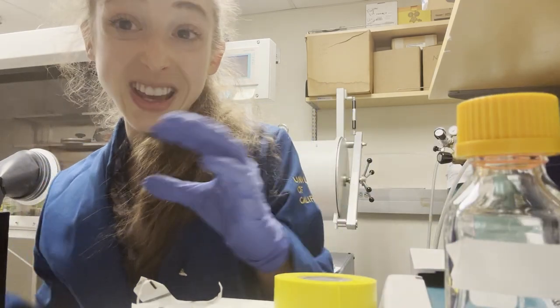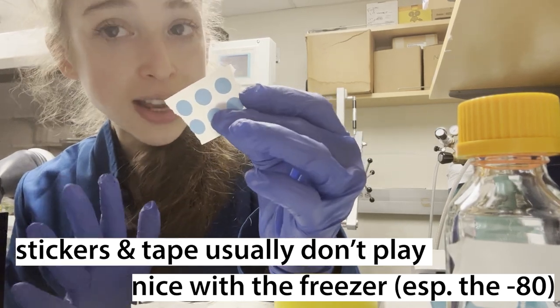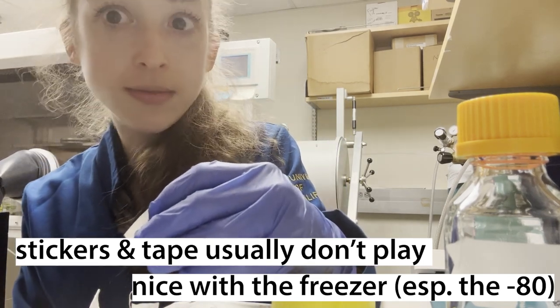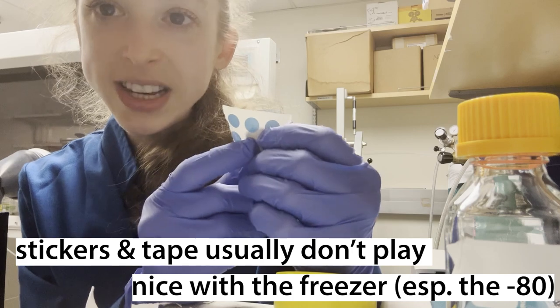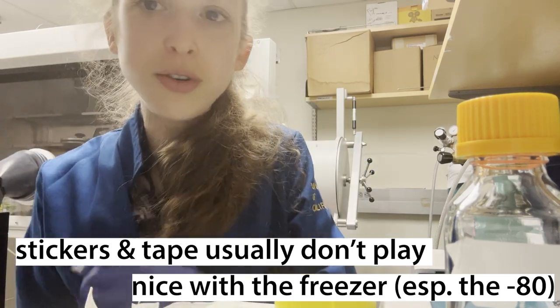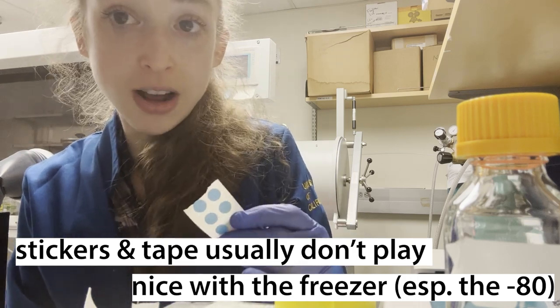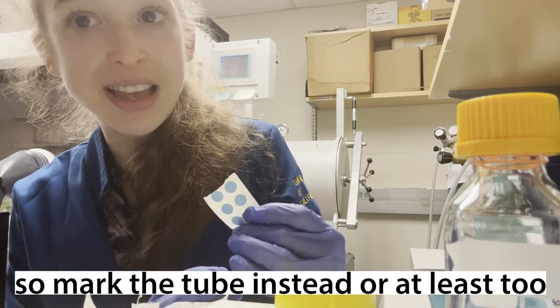If you're using something that's going in the freezer, be really careful with any tape, even those cryo dots that say they're safe for the minus 80. Especially if you're doing some sort of snap freezing — if these touch liquid nitrogen, they typically pop off, which is really non-ideal. Especially when you do all this work putting labels on, which are nice because you can write more easily on them and some are even printable. You label all these tubes, flash freeze them, put them in the freezer, and then you look and all the labels have come off. True story — it can happen. So put some sort of marking on the tube itself just in case the label falls off.